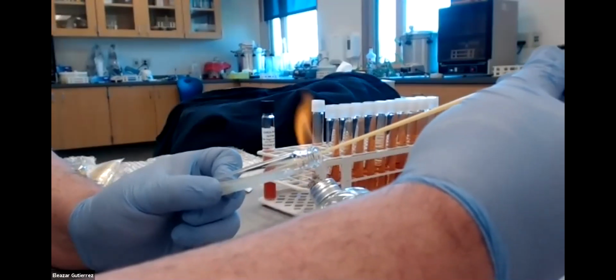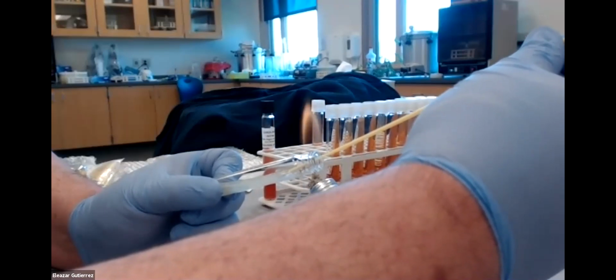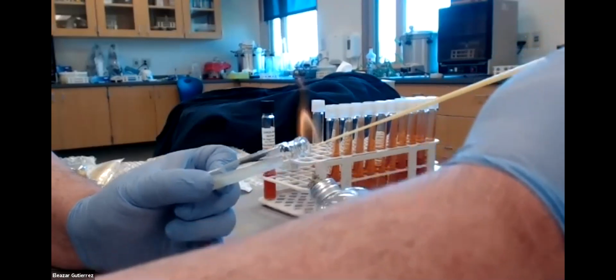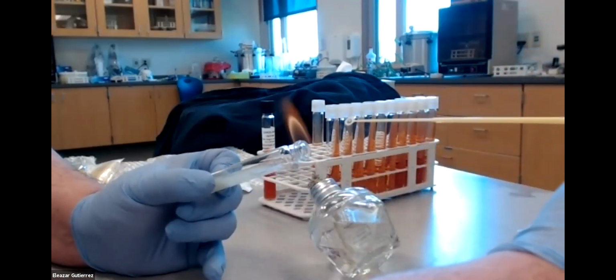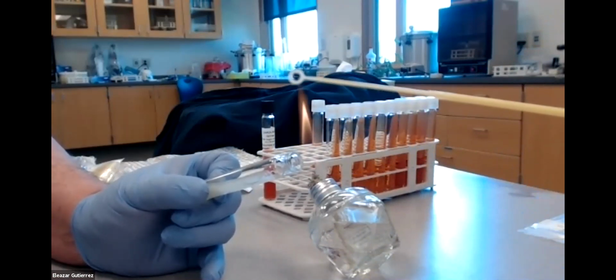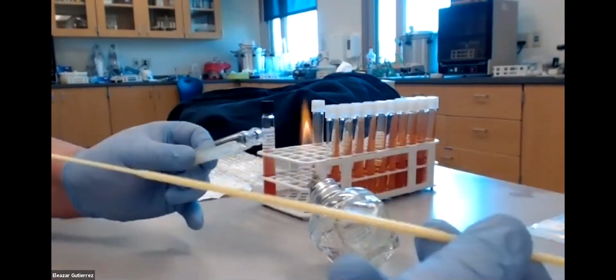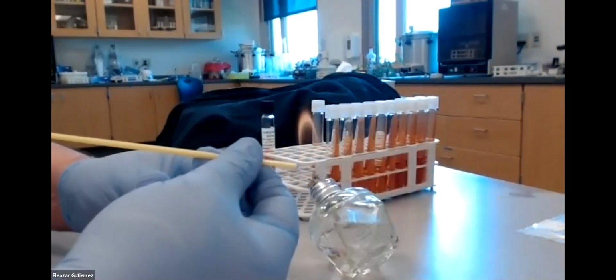And I'm going to grab an inoculum of E. coli, like so, nice and gentle. Okay. It can barely be seen, but I can see it with the naked eye. It's right there on my nichrome, nichrome. This is not a nichrome loop, on my plastic loop. I'm going to flame my slant. I'm going to recap it.